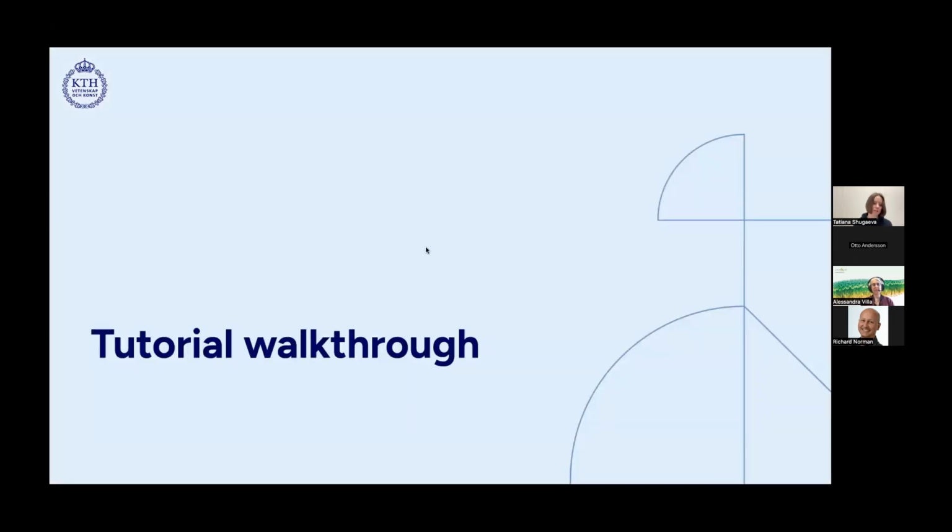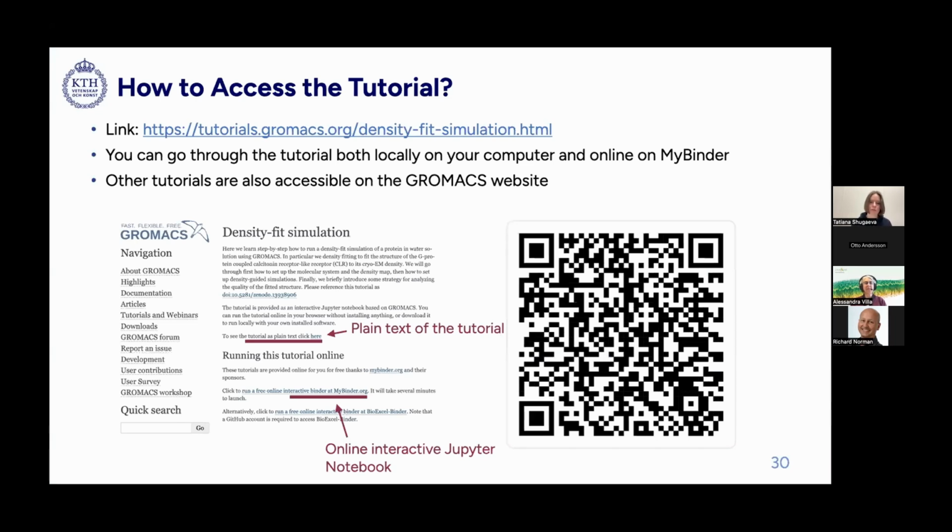This is the end of the first, theoretical part. Now we can switch to the tutorial walkthrough. These are different ways you can access the tutorial, like the QR code or the link. If you proceed to this link, you will see the page on this left image.